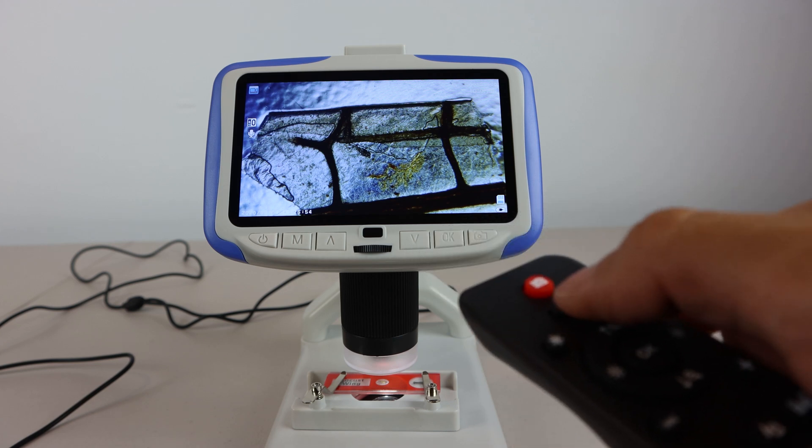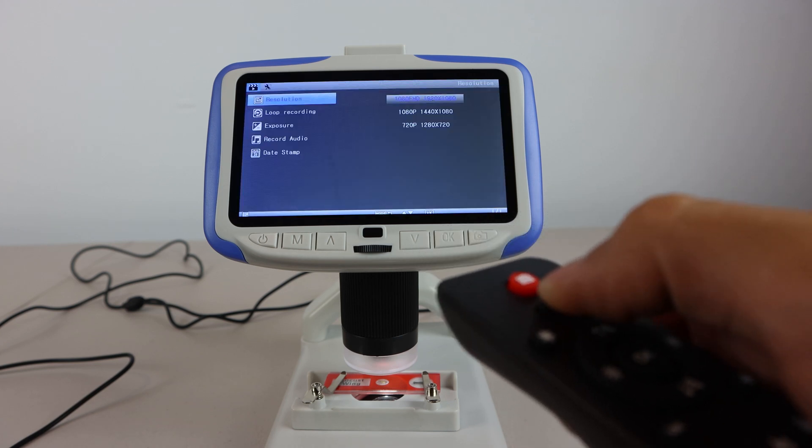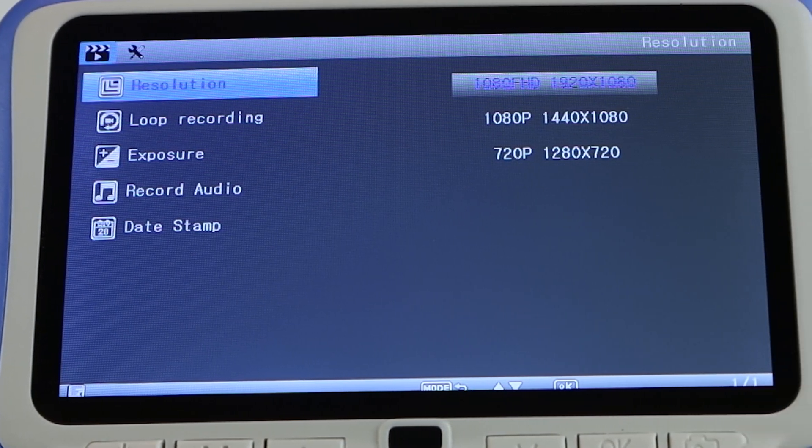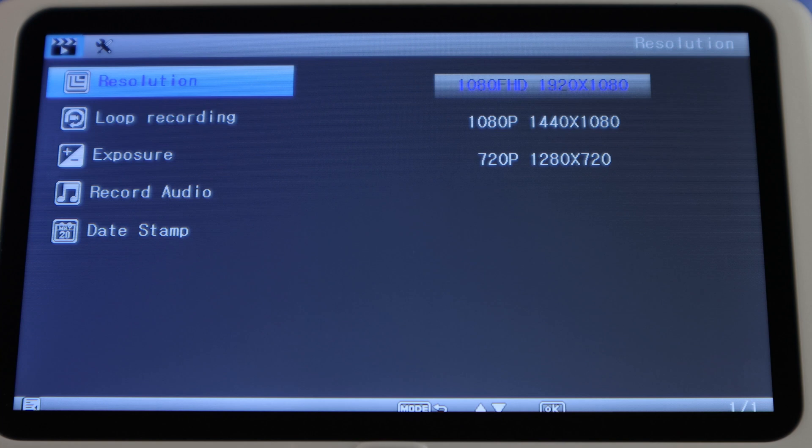The menu key on the remote allows you to change the unit's settings. Though note that this menu can't be accessed using the physical keys. So it's important that you don't lose the remote.